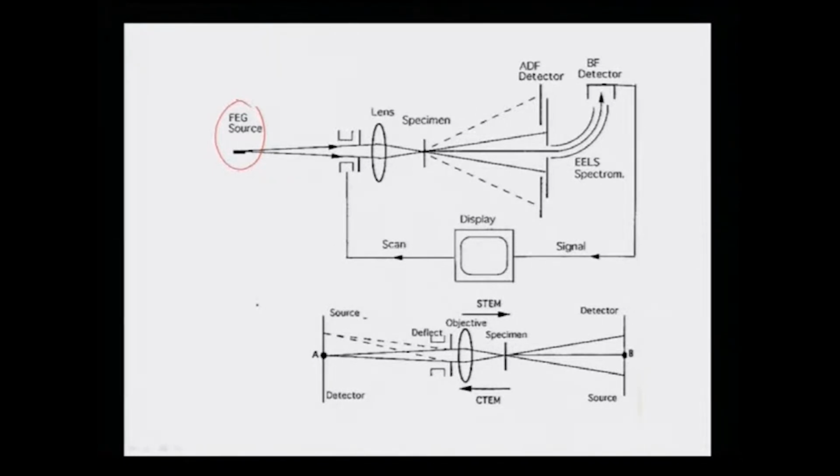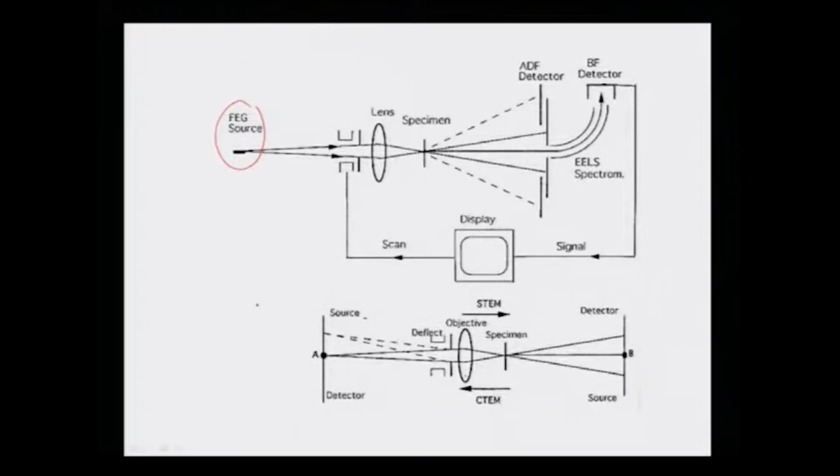It is shown very nicely here in the second picture, where you can see this is a source or electron beam, which can be scanned over the sample by using a deflector, as in a normal scanning electron microscope. This beam falls on the objective lens, which focuses or demagnifies the electron beam to a very small size beam, called a convergent electron beam, on the specimen. Then the specimen diffracts, and we can get different kinds of information which are listed there.